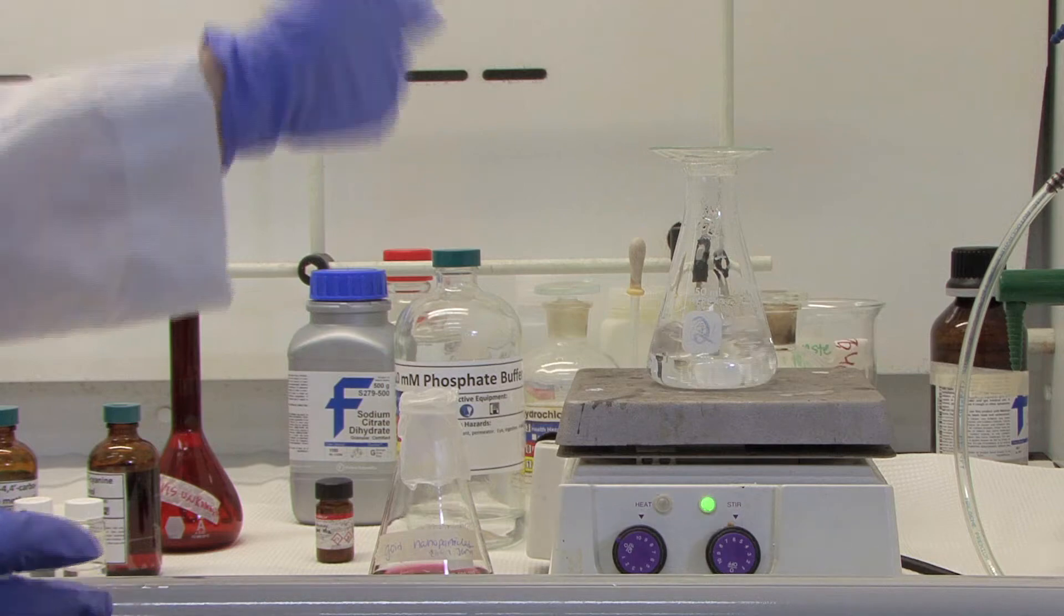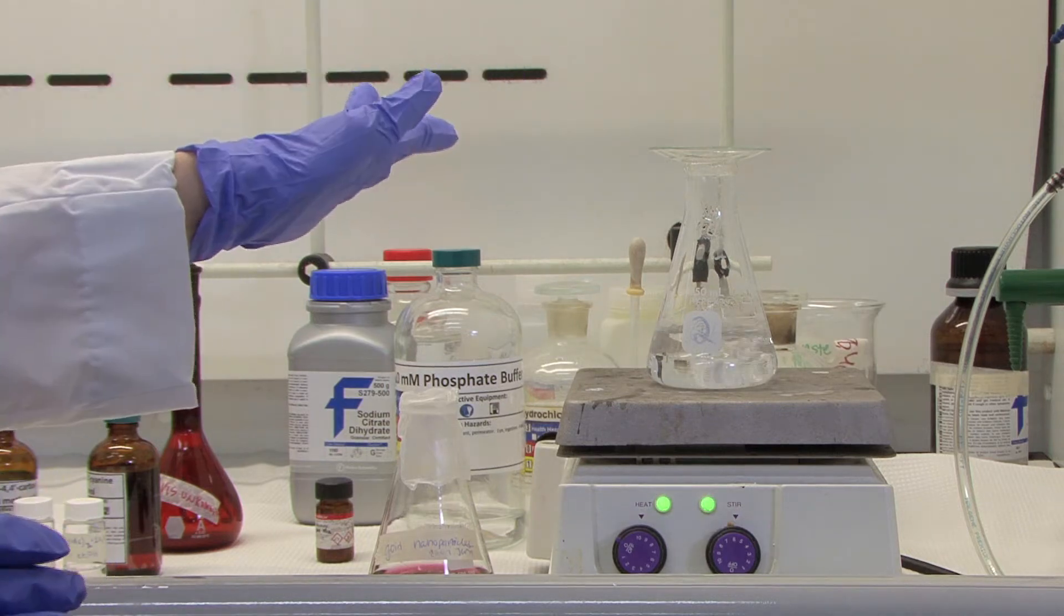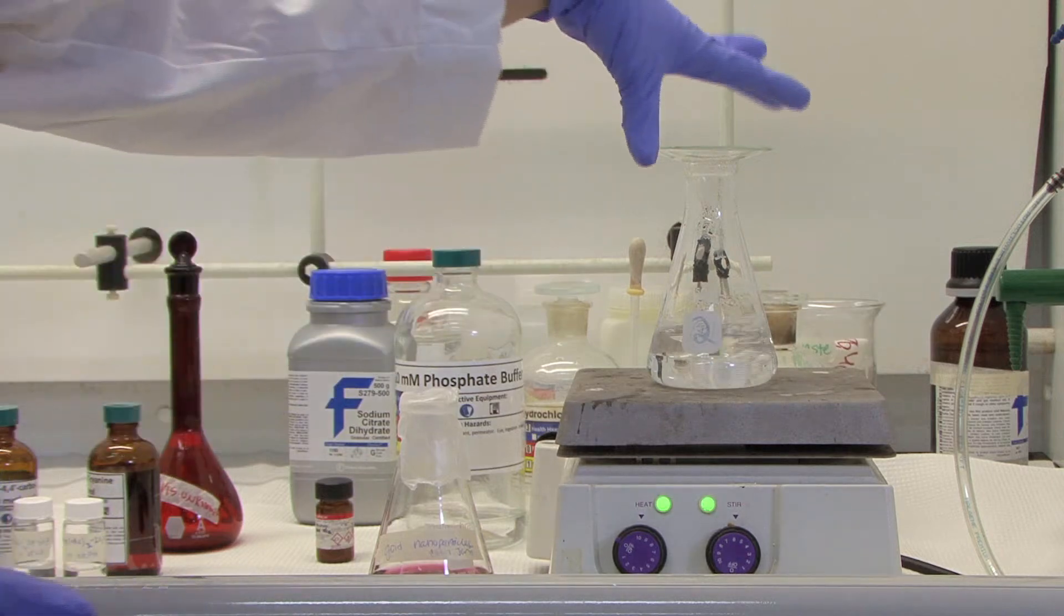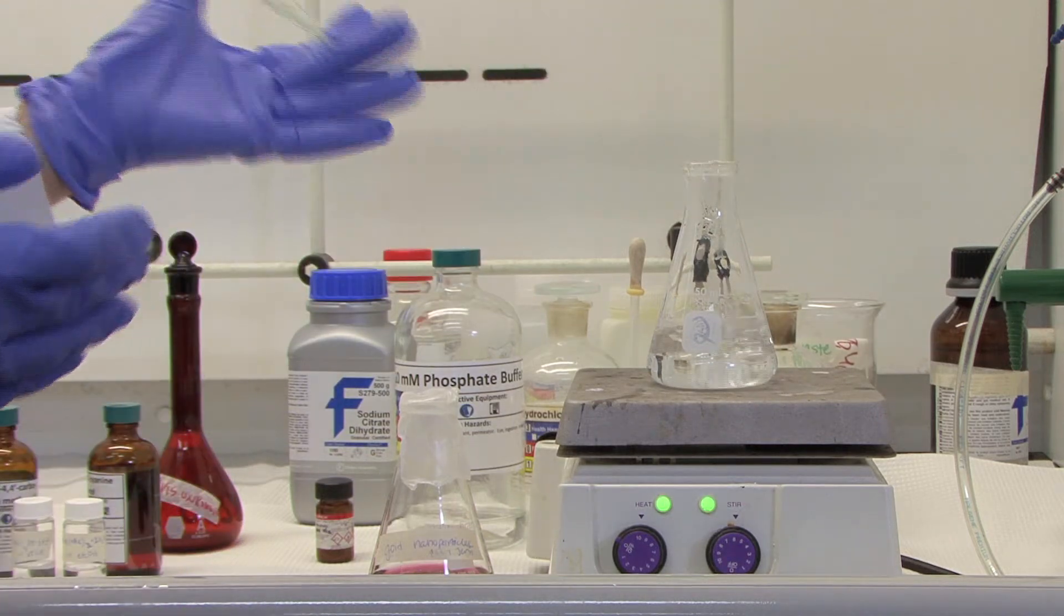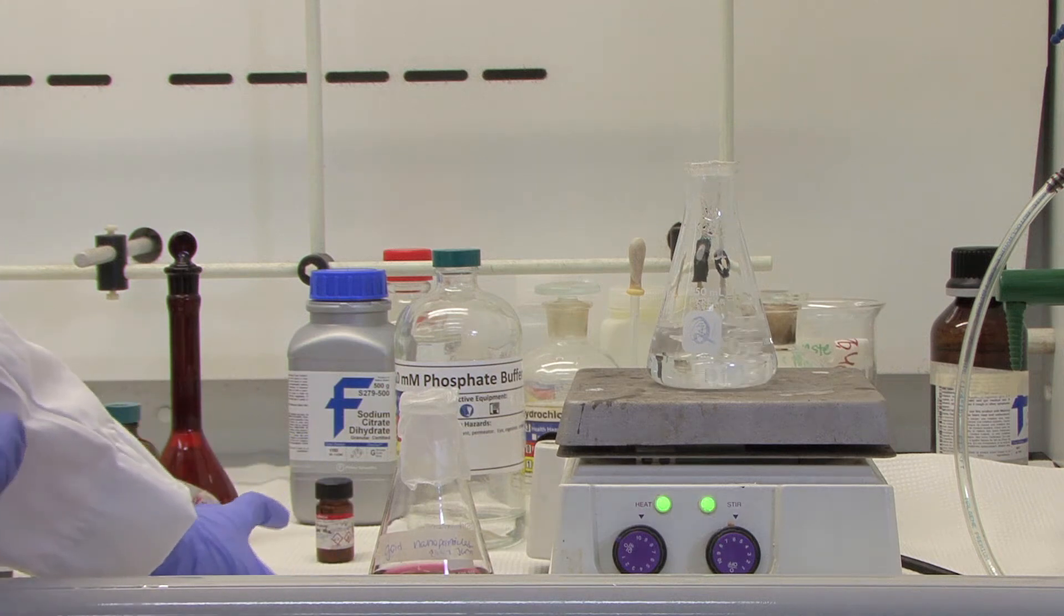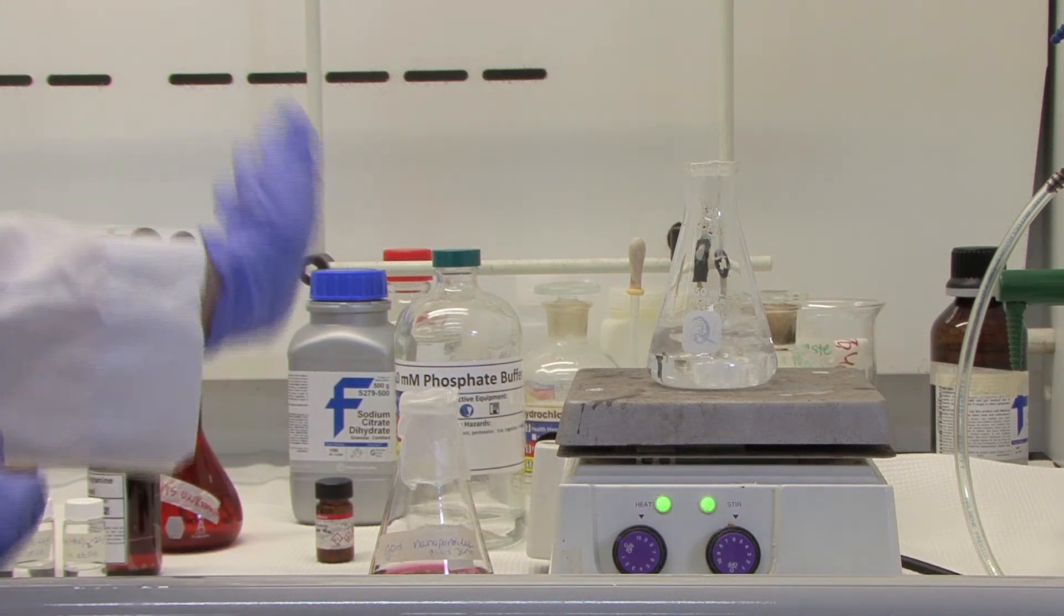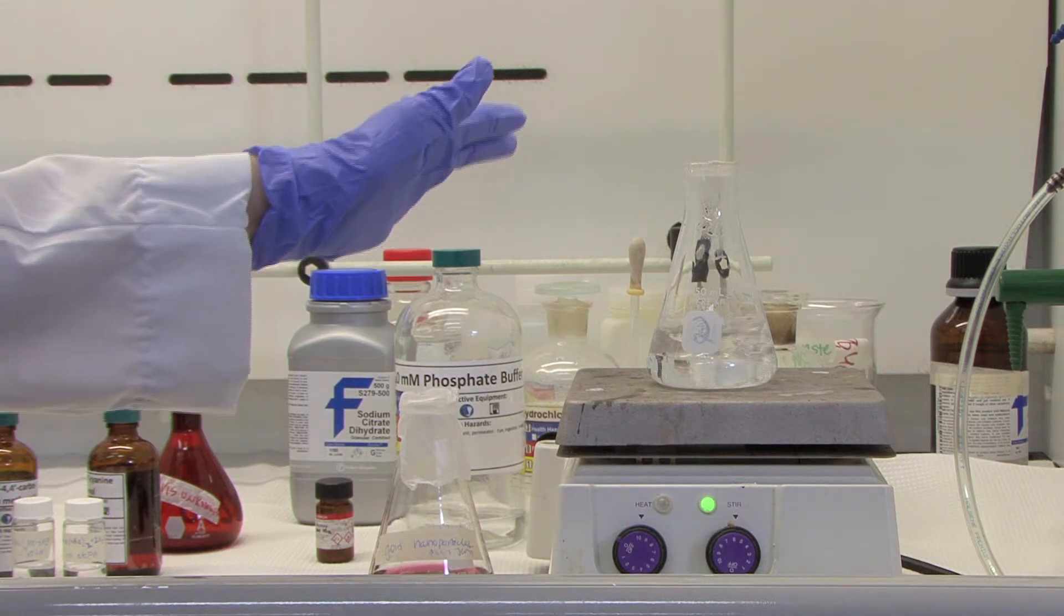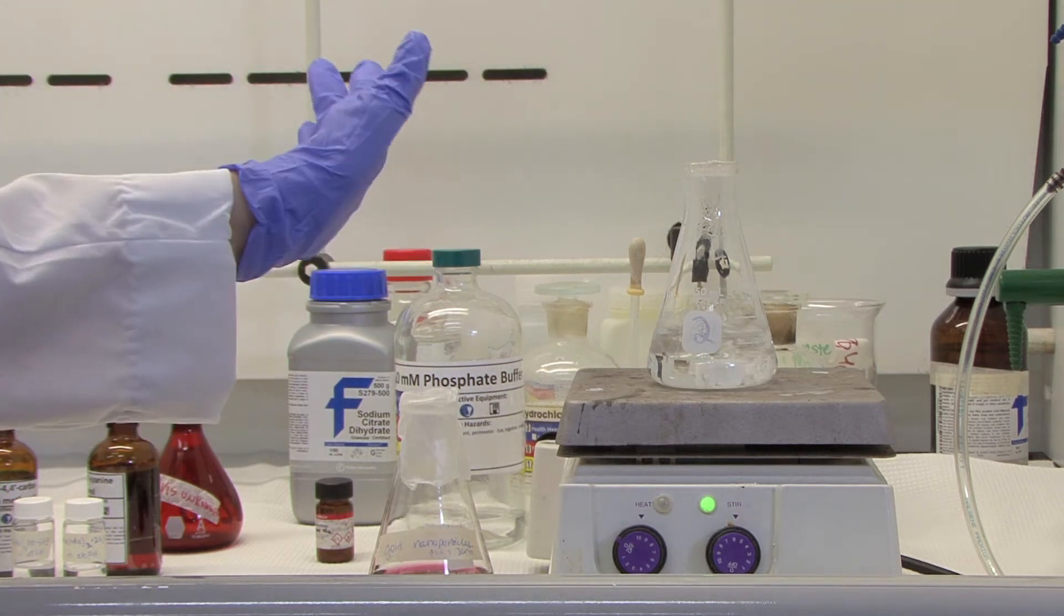In your chloro-auric acid and water solution, you want to make sure that it's at a rolling boil like shown here, and that it is not just boiling around the stir rod. Also, it is important to make sure you add all of your sodium citrate solution at one time when your solution is boiling. Otherwise, your gold nanoparticles will not be synthesized properly.